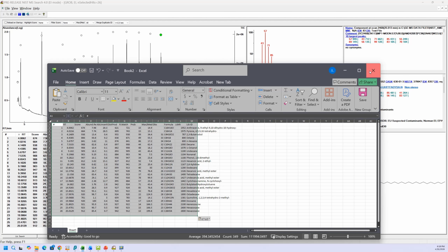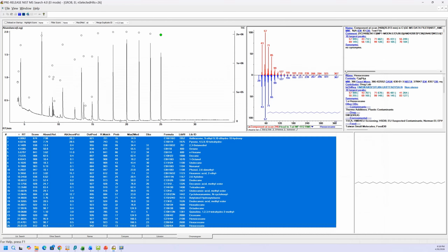So that's really pretty much the basics. Like I said, you might want to look at my handout because I might have missed some things. I was looking through my list of things to talk about. I think that's the majority of what I wanted to talk about. But there was one thing I did leave out.